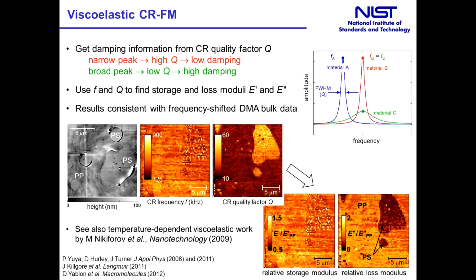The contact resonance results were consistent with values obtained on bulk samples of the same materials using dynamic mechanical analysis. And these measurements had been frequency shifted up to the contact resonance frequencies using time temperature superposition techniques.